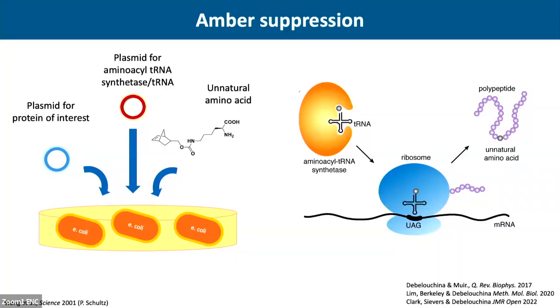And so whenever I've submitted this for grant proposals and also when I've talked to some of you about it, the reaction is always the same. This is a nice idea, but it never works for NMR. We have by now shown in at least 6 different systems, both in mammalian and bacterial cells, that unnatural amino acid incorporation can work well, even under isotopic labeling conditions. So far, any protein that we've wanted to make with an unnatural amino acid, we have been able to do so. However, not every position we've chosen has worked.